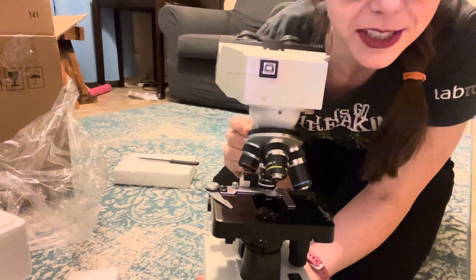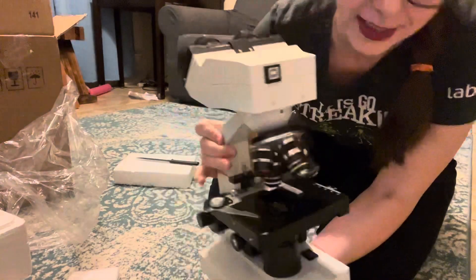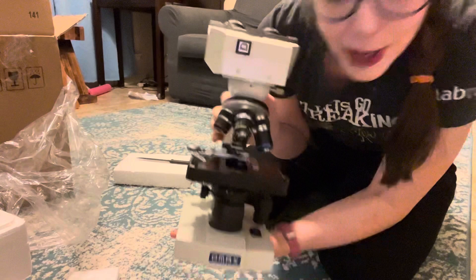I've got all the different objective lenses, got the nice little binoculars. It's nice and heavy. Hopefully whenever I turn it on, it all works the way that I want it to.